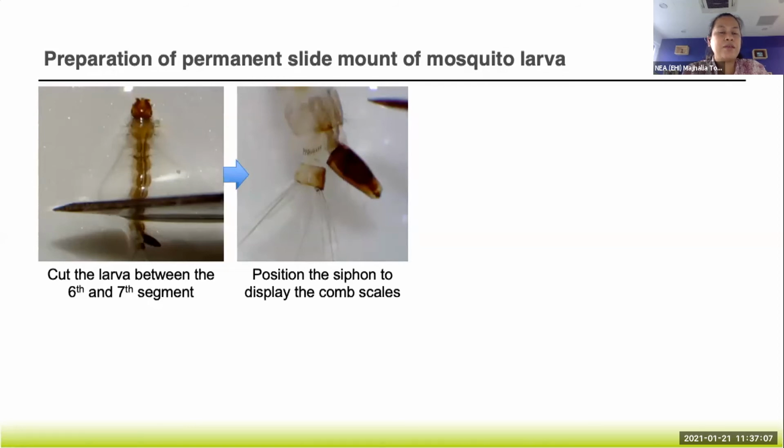Actually, yes, I've seen some literature that says that you can use glycerin in handling your specimen because it will not dry up your sample while you are trying to position the hairs and other structures on the slide. But I'm sure there is a different way of mounting it when you're using glycerin. So that one I am not particularly sure, but we can explore it. I've seen it before that they do use glycerin.